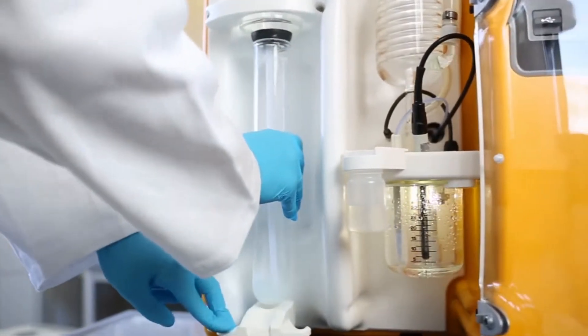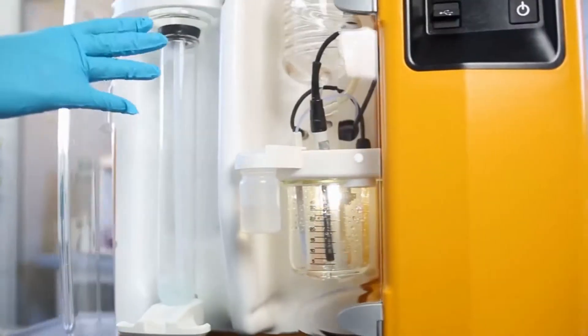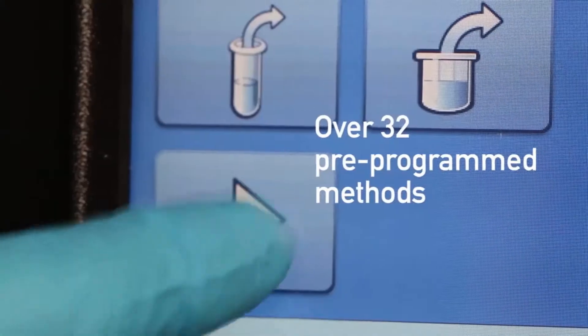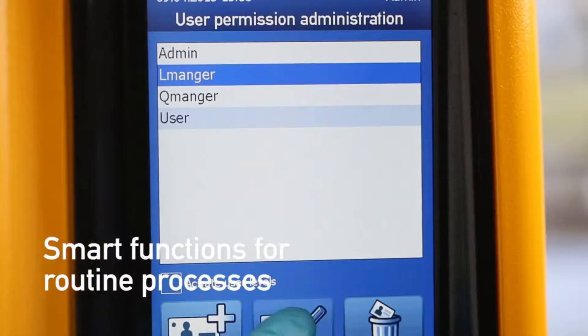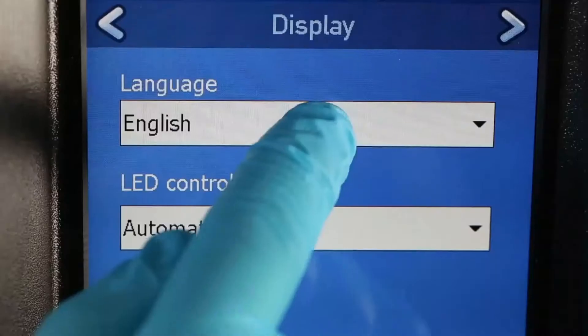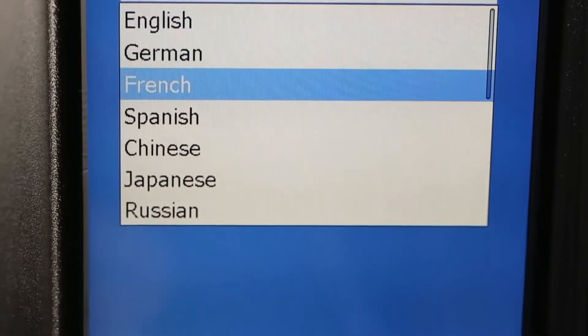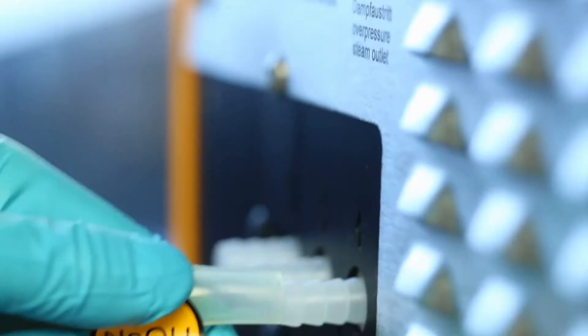Simply insert the sample, close the safety door and press the start button. The optional password protection feature and various user levels guarantee that the device is operated only by qualified personnel.